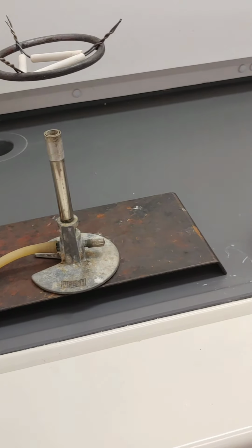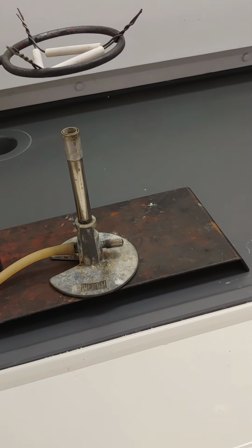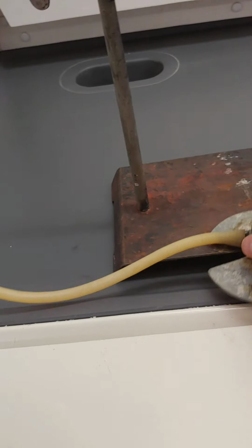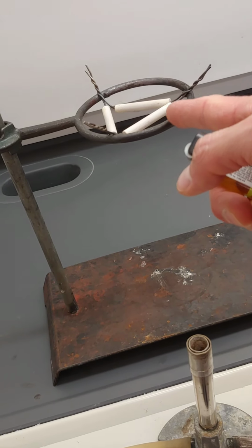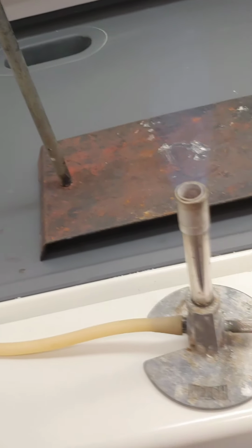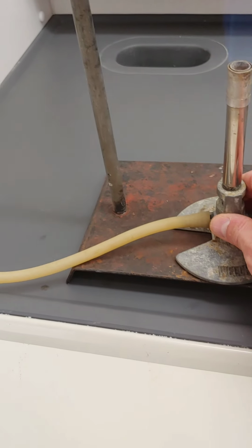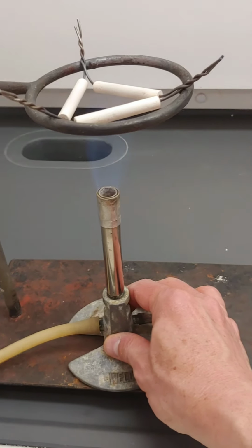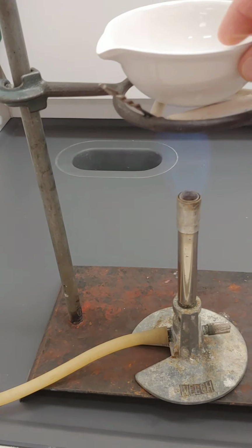So the first thing we do is we turn the gas all the way on, and usually the way that I found the simplest is to move the Bunsen burner out so that it's not right under the ring stand, because otherwise it can be kind of hard to light it. So what I usually do is light it outside of the ring stand and then place it under the ring stand. And so now I've got my Bunsen burner there, and I'm ready to go ahead and place my evaporating dish on top of that.